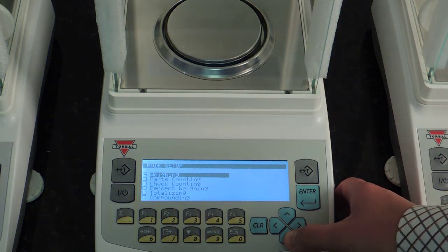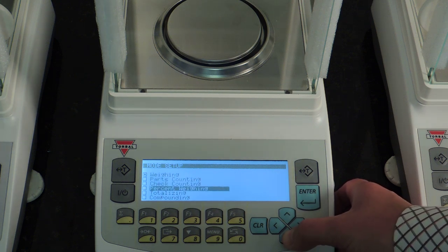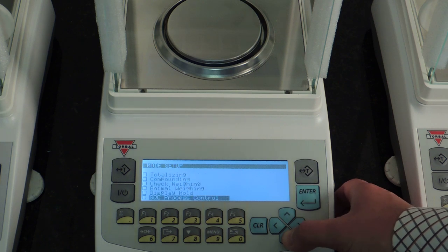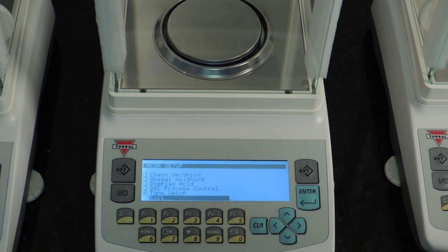Some of the functions that we have in here is obviously weighing, parts counting, check counting, percent weighing, totalizing, compounding, check weighing, animal weighing, display hold, SQC, tear setup for preset and stored tears.